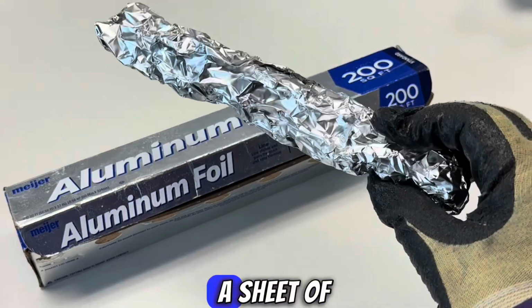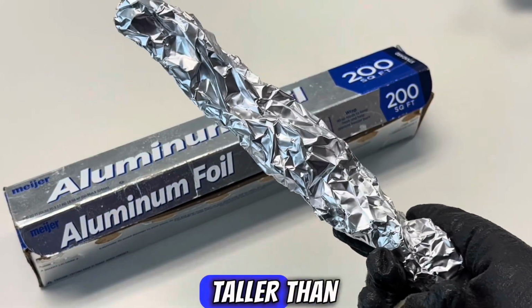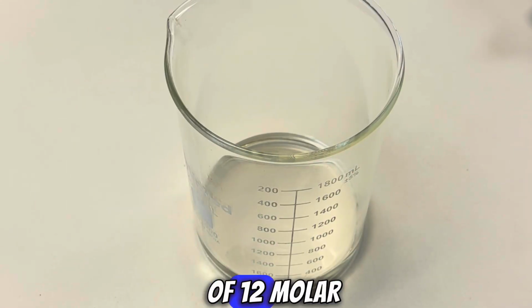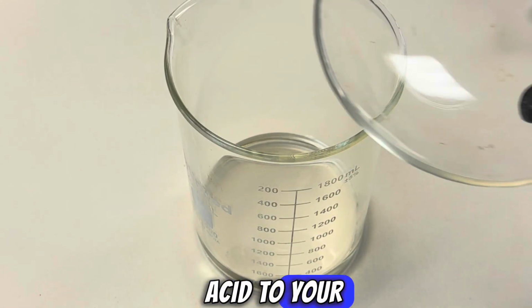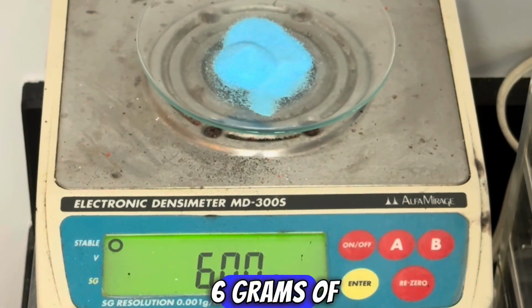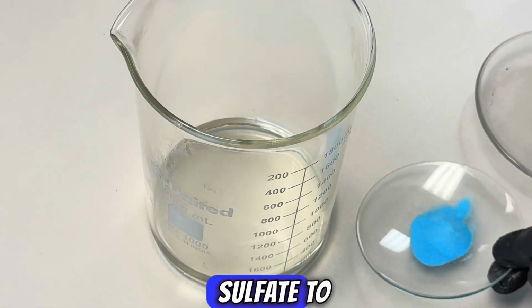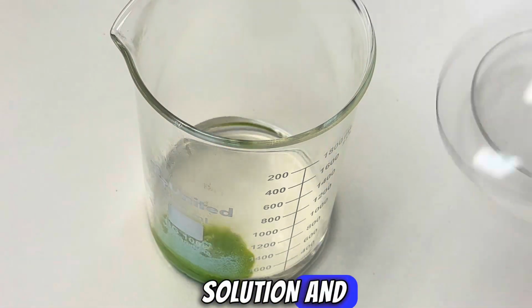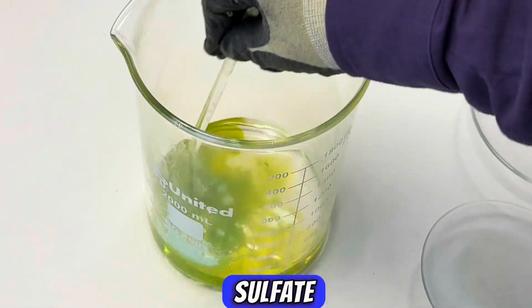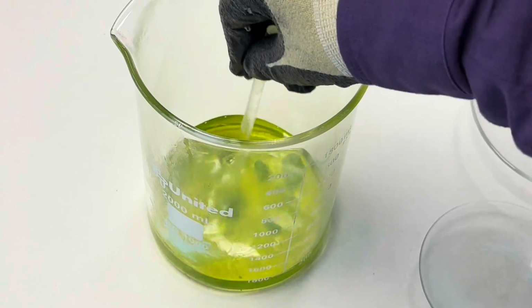Begin by tearing off a sheet of aluminum foil and wadding it into a stick that's slightly taller than your beaker. Add 200 milliliters of 12 molar hydrochloric acid to your beaker. Measure out 6 grams of copper 2 sulfate. Add the copper 2 sulfate to your solution and stir until aqueous. You'll notice that the copper 2 sulfate creates a green solution with the hydrochloric acid.